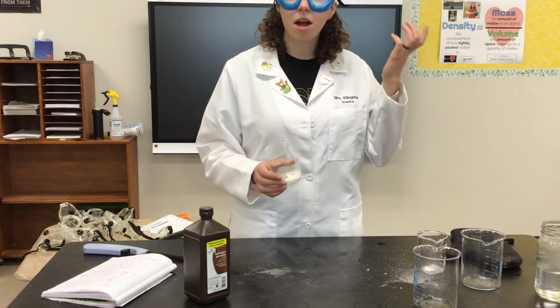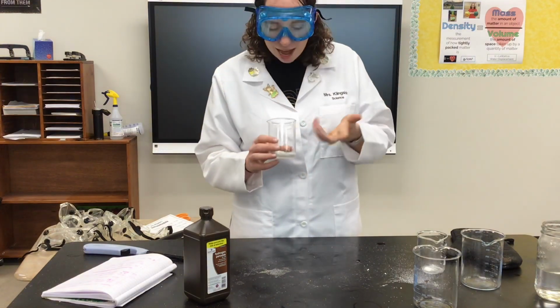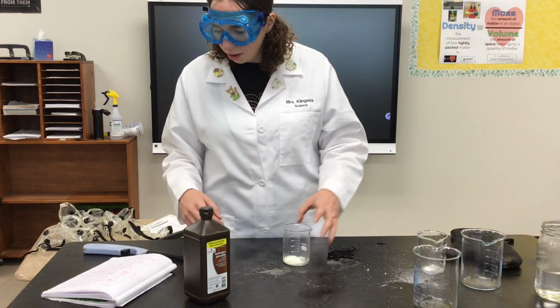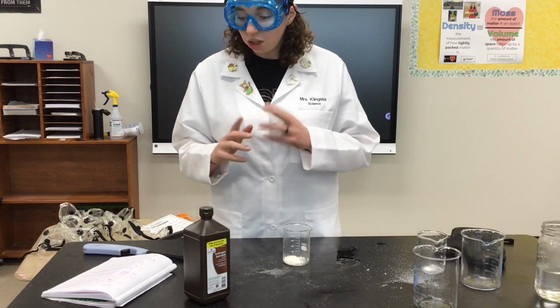Vitamin C can come from citrus. So again, talking about oranges and limes and stuff. But vitamin C helps you keep your immune system healthy. And so that's all this is, vitamin C. And then what I'm going to do is add in 120 milliliters of distilled water.